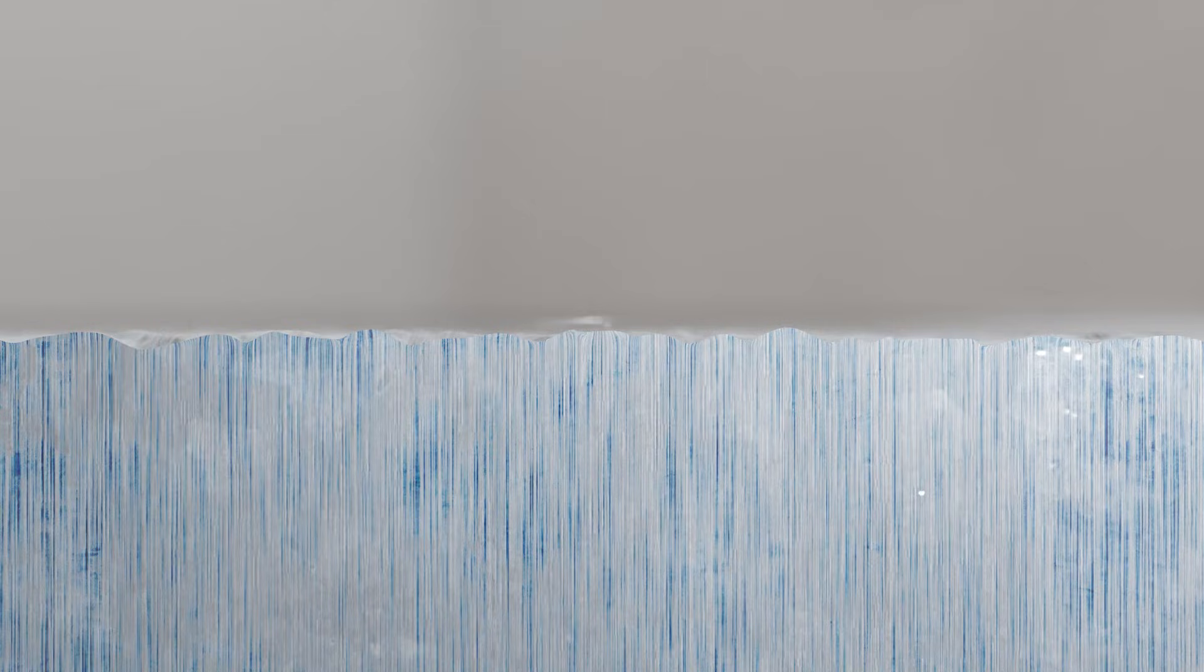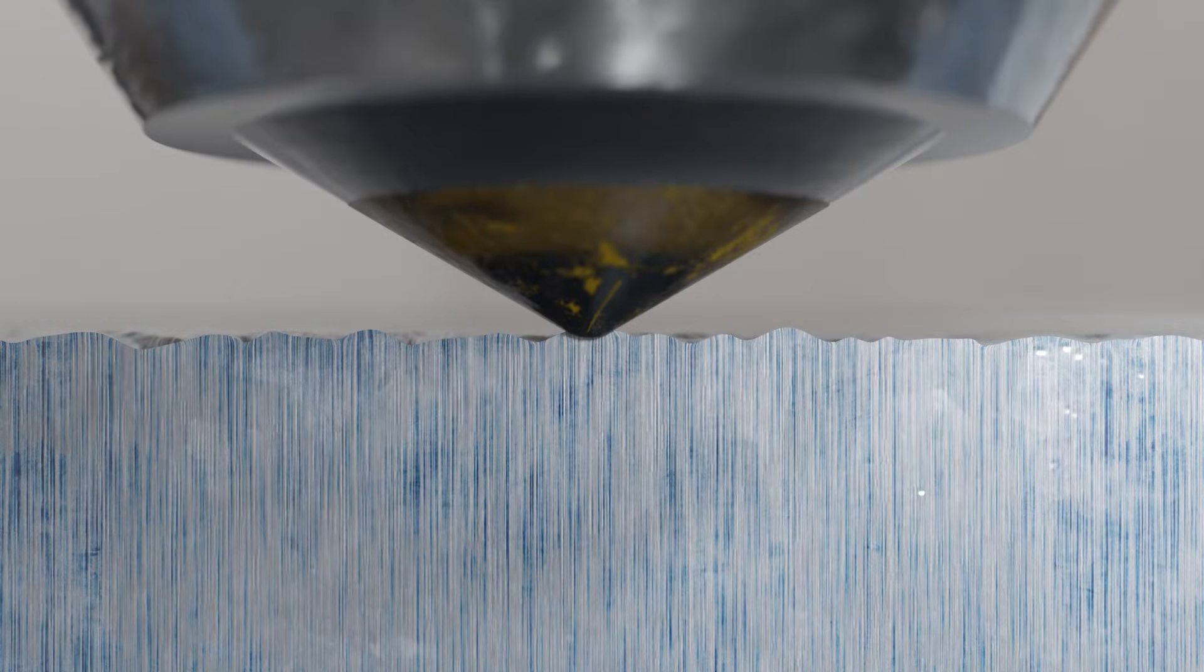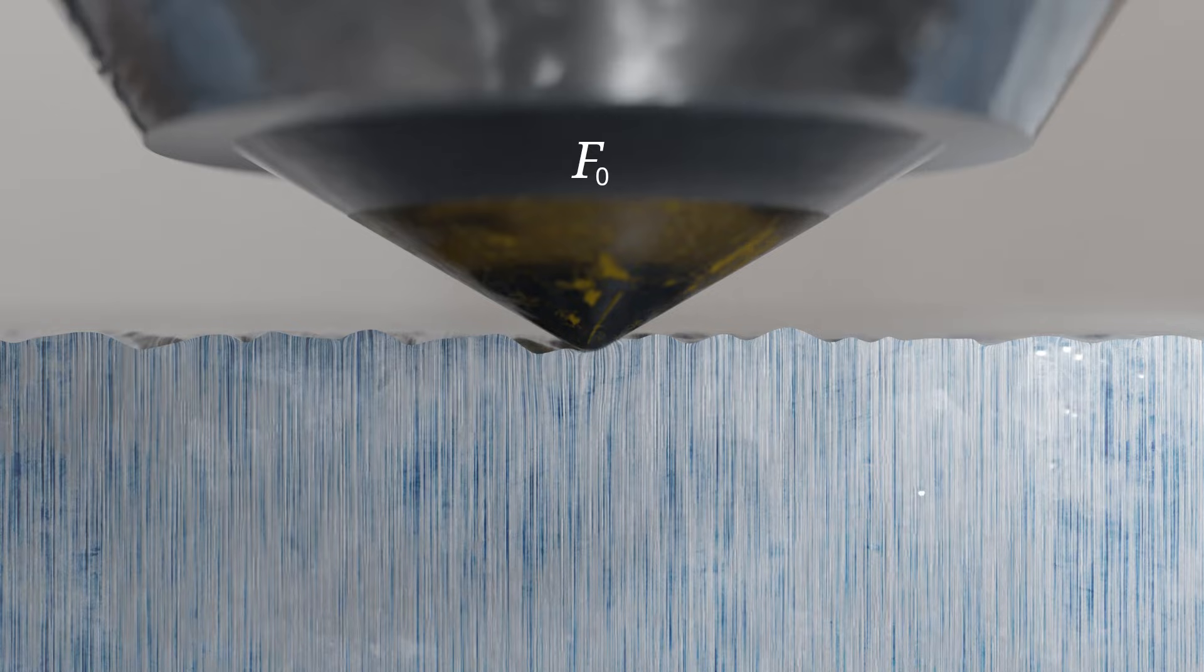The Rockwell hardness test is performed in three steps. First, the indenter is applied to the test surface with a preload F0 of 10 kilopons, equivalent to 98 newtons. This initial load compensates for potential setting effects in the sample and any clearance in the measuring instrument. Additionally, it eliminates surface irregularities on the material sample, which could otherwise significantly affect the depth measurement. After holding the preload for a brief period, the depth measurement sensor is set to zero. This zero point serves as the reference level for measuring the indentation depth.